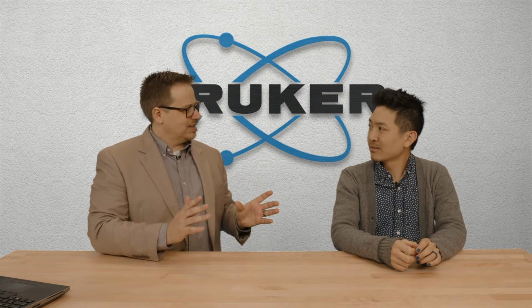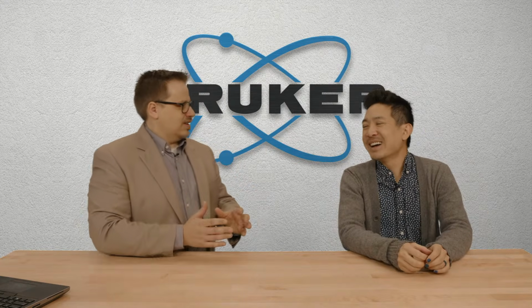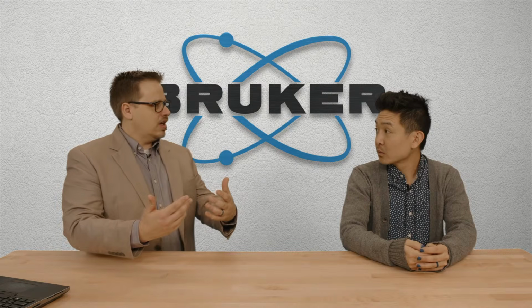Scaling intensities. And then kind of pushing the boundaries these days is to say, well, what if this is something different or something new? It's not in a database, right? So like for most fun science, right? It's like, what if you don't actually have all the pieces of the puzzle? Okay. Right. So now one of the most innovative parts, I think, of EVA is the ability to do some quantitation if you don't have it.